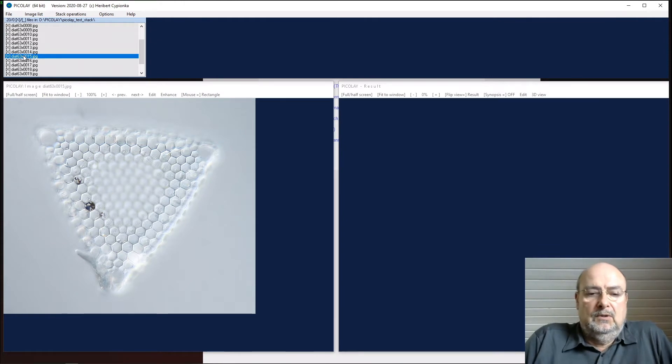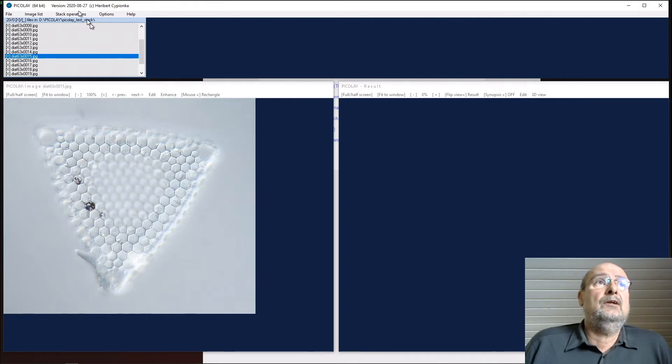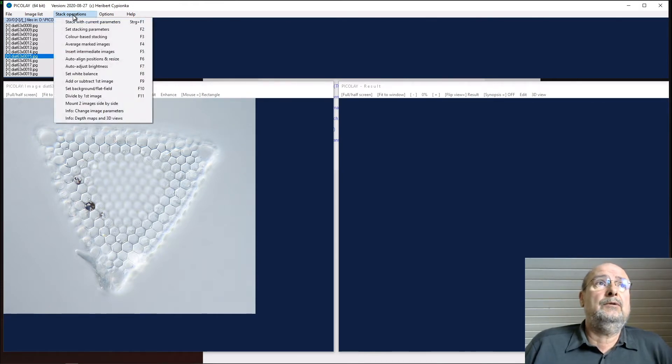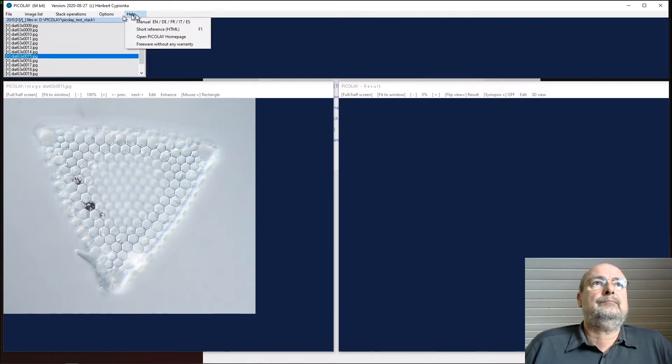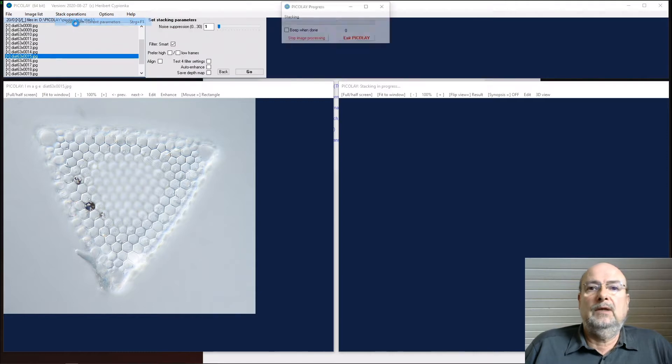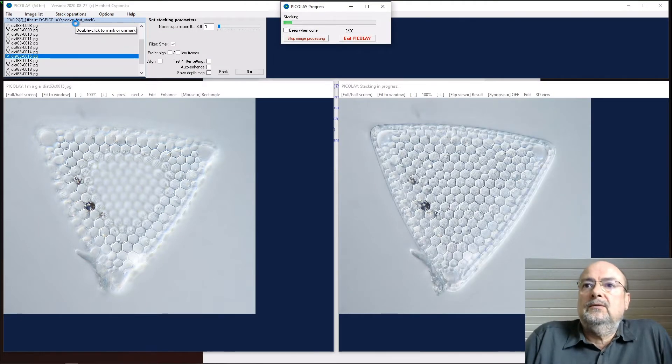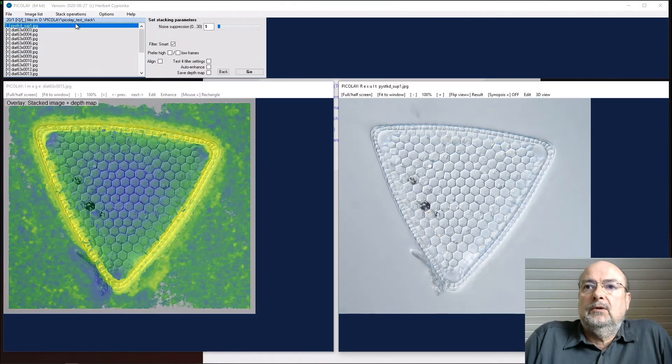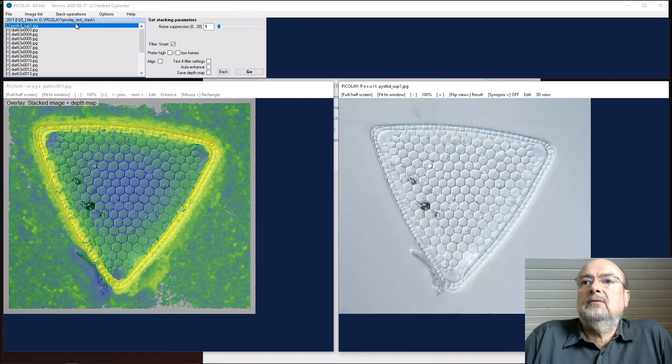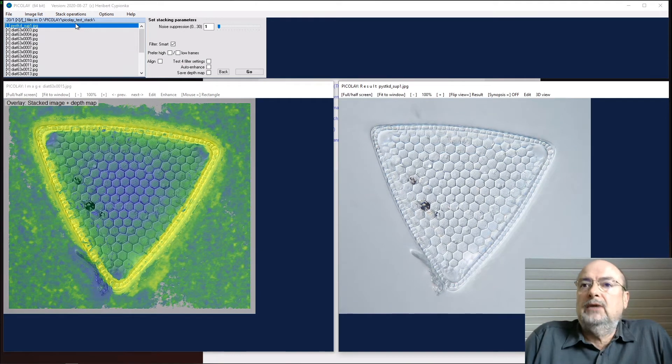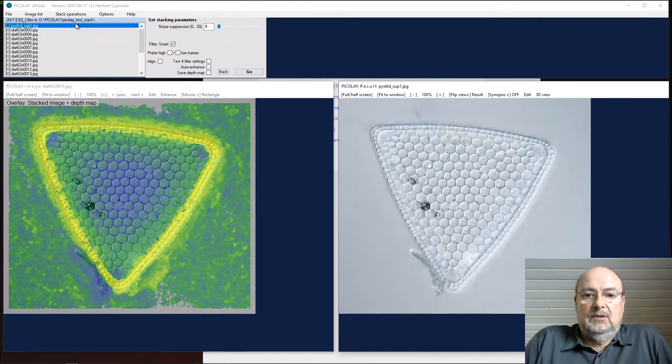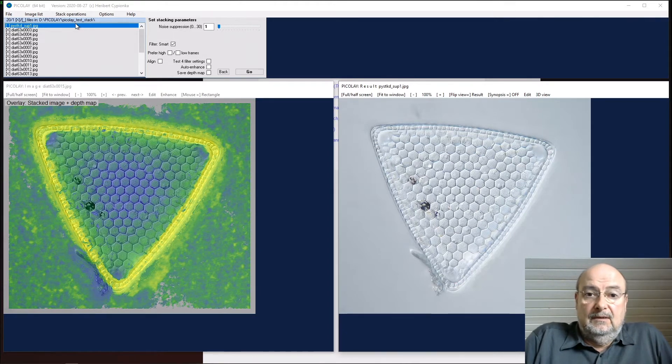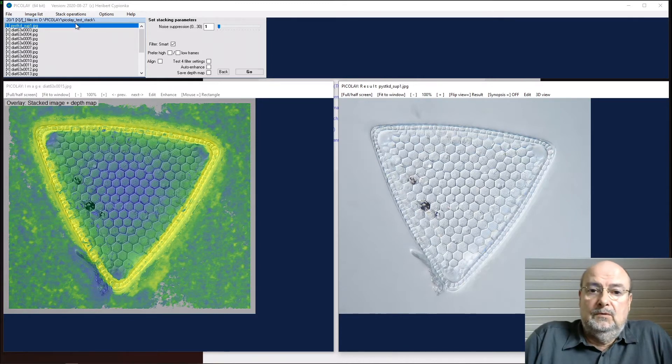If you want to do focus stacking, users don't always know how to do it. The very simple thing is just to go under stack operations and say stack with current parameters - Control F1. I can do that. You see it's a small stack, it's fast, and you get a nice result already.